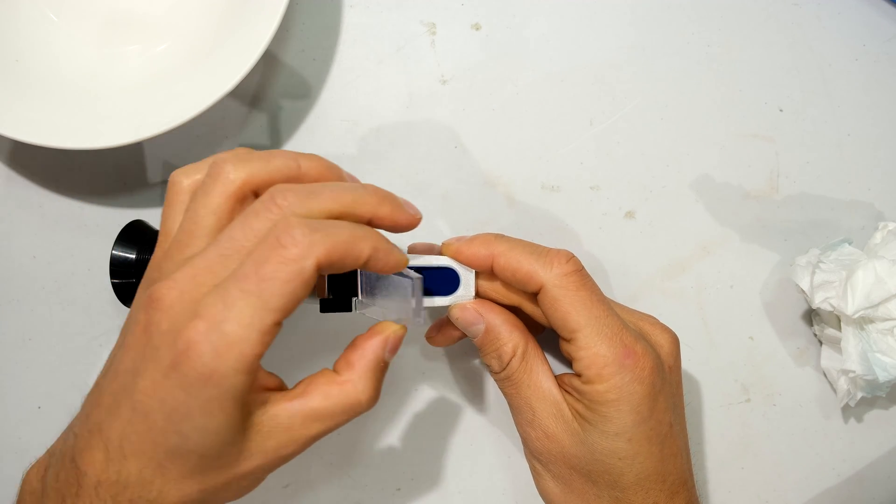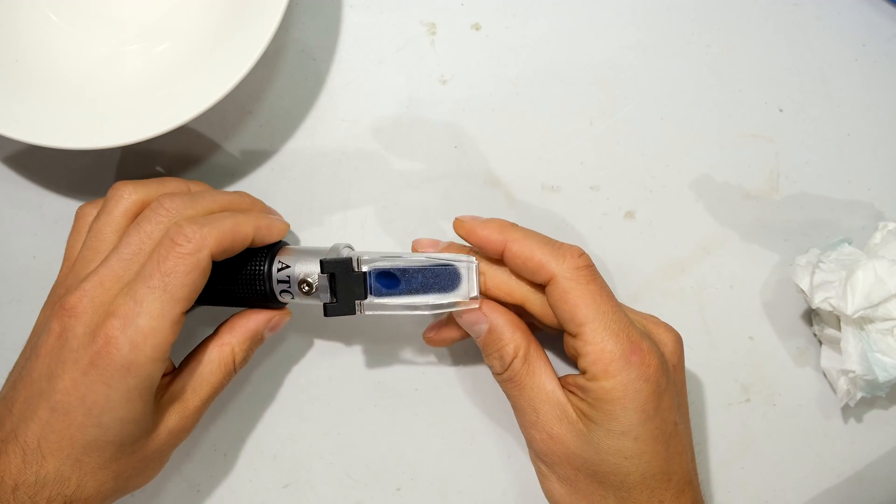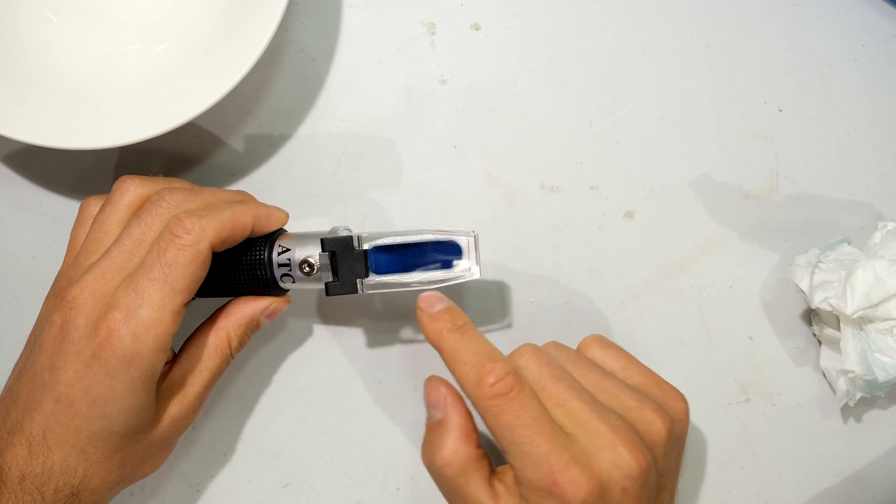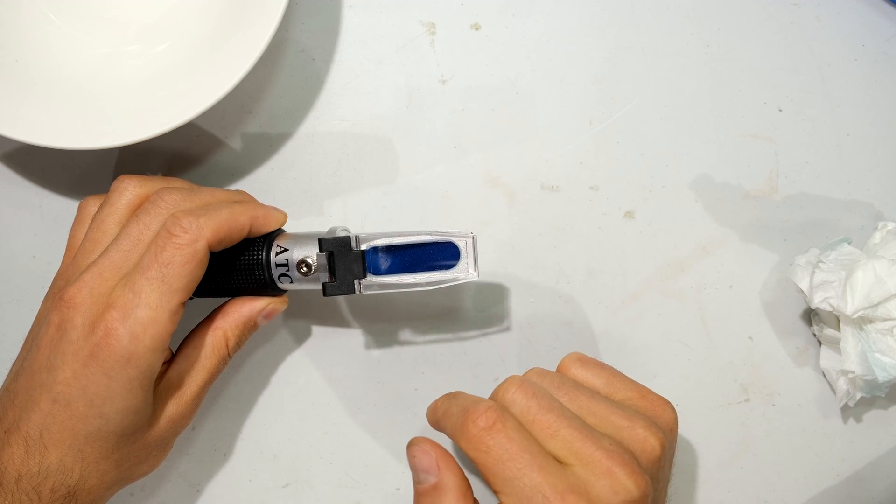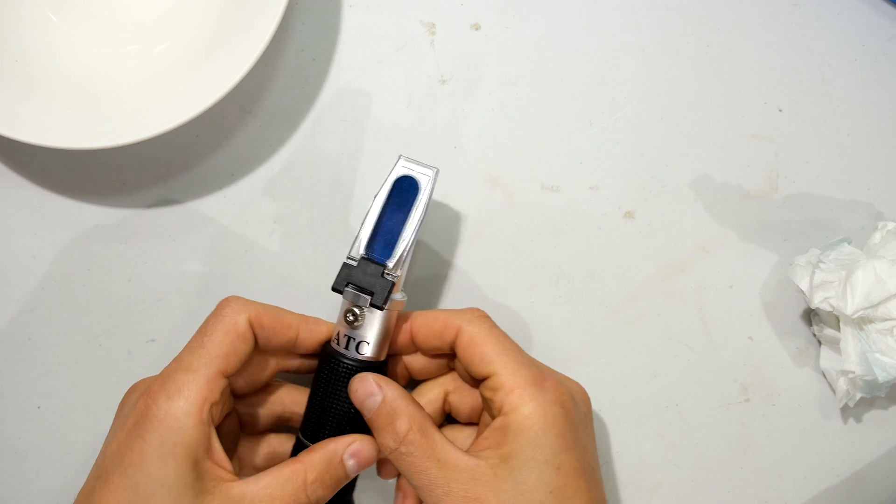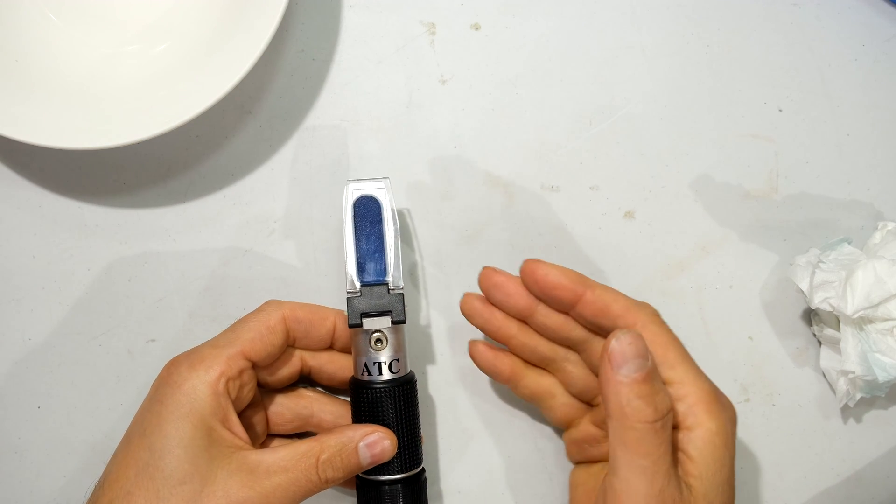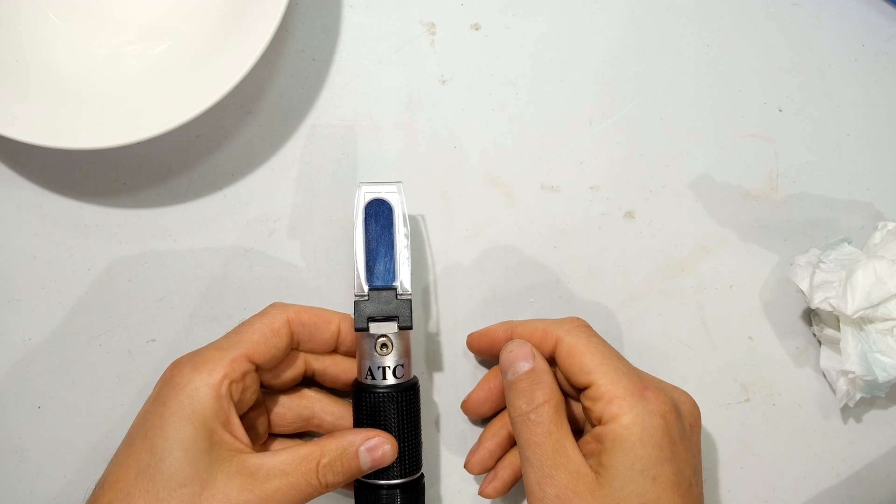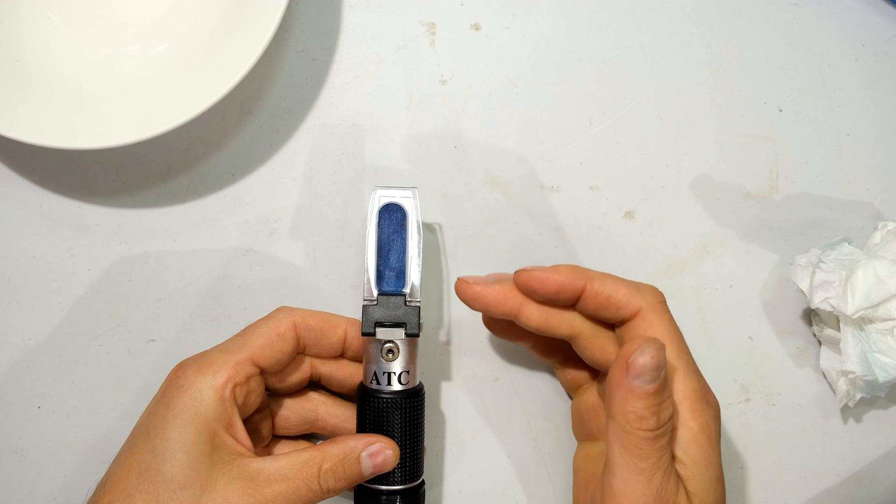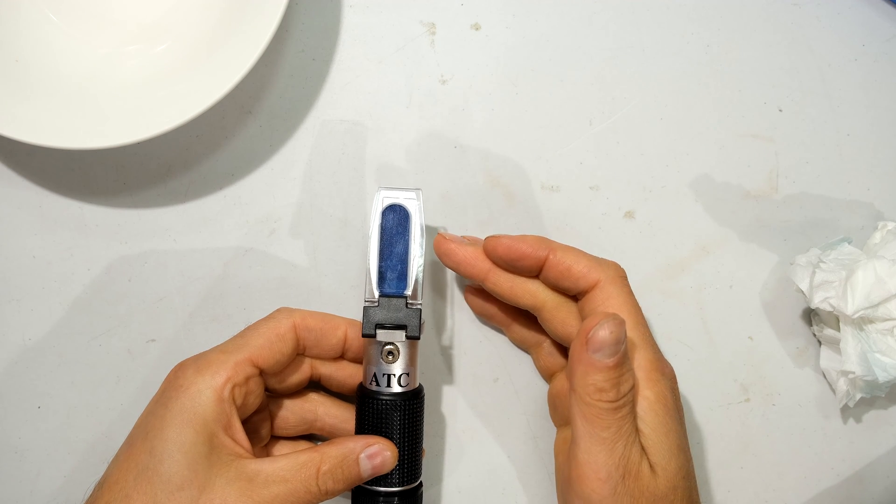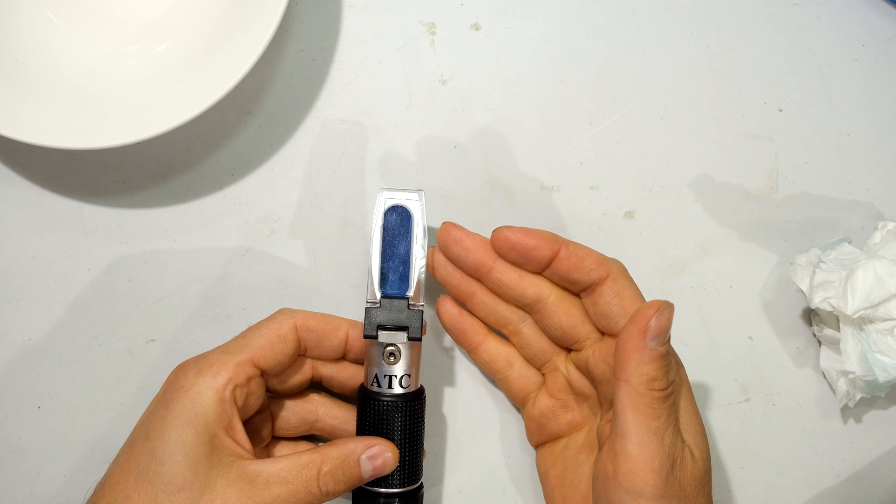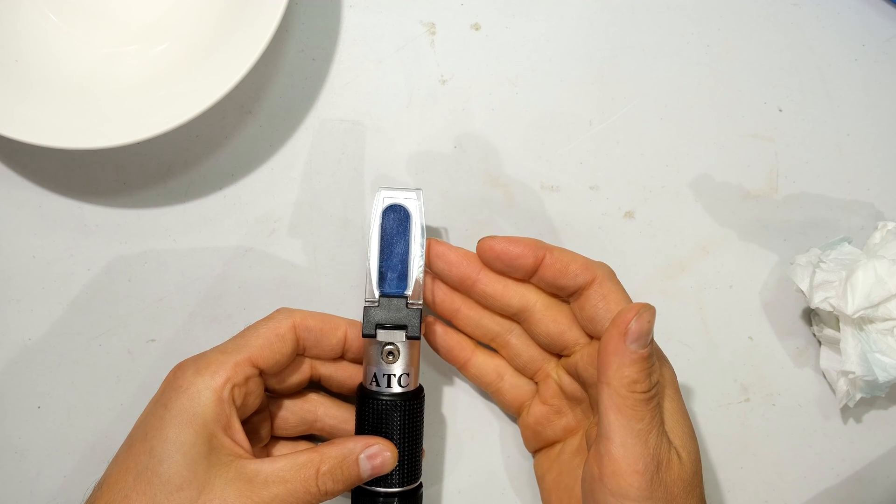Close the daylight plate. Try not to have any bubbles there. Now leave this for about half a minute. The reason being is we want the temperature of the distilled water to get to the temperature of the refractometer.